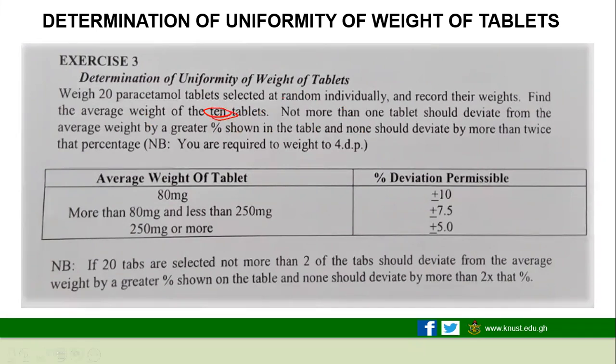Now, this is the standard. We are saying that not more than one tablet should deviate from the average by a percentage greater than shown in the table. Let's go to the table and then I will explain these statements.